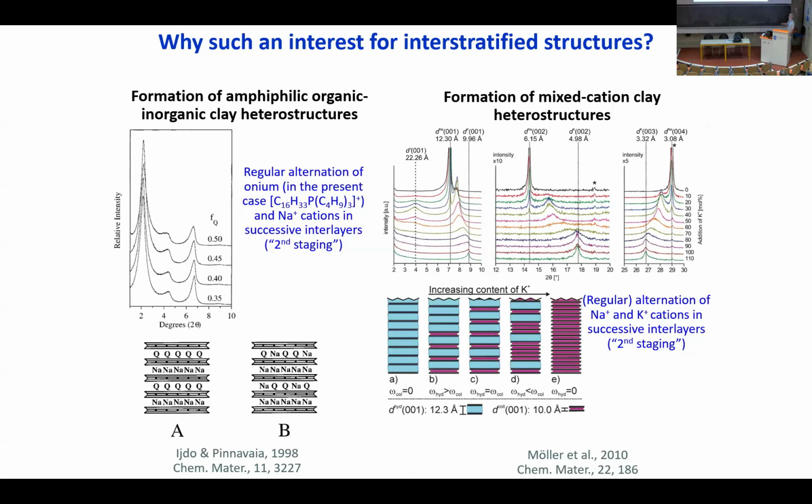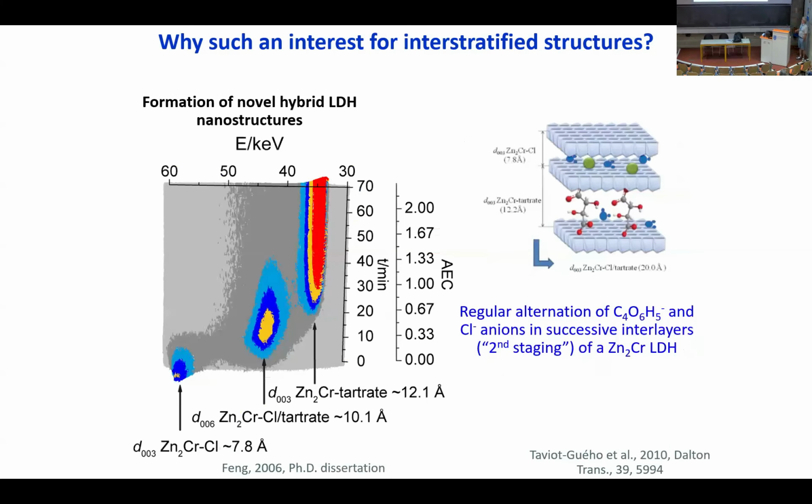It was also investigated for partial exchange of inorganic sodium cations by organic cations in an effort to prepare amphiphilic materials having both the hydrophilic properties of inorganic interlayers and the hydrophobic properties of organic interlayers. This is another example. Just think of this scale as a 2 theta scale.